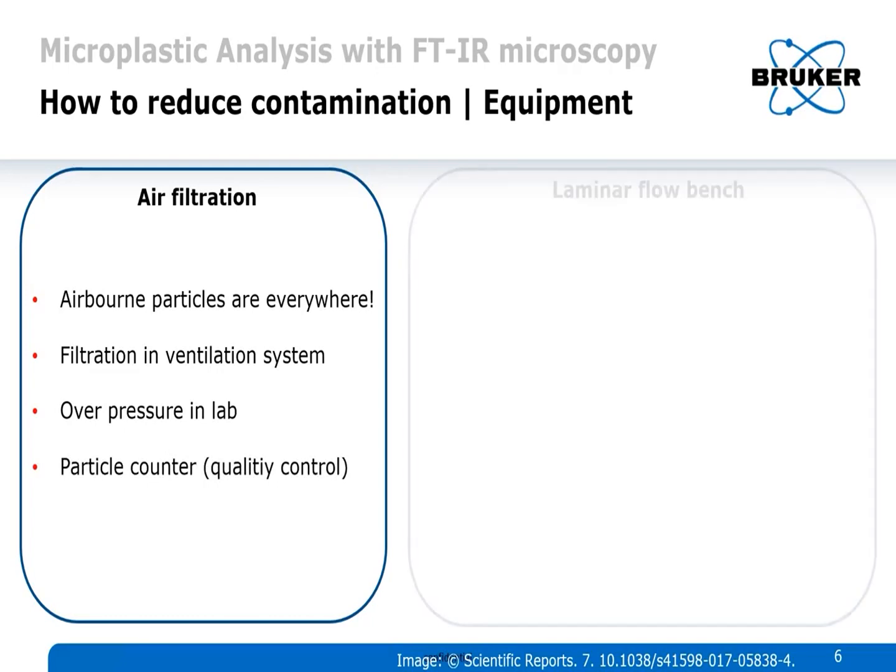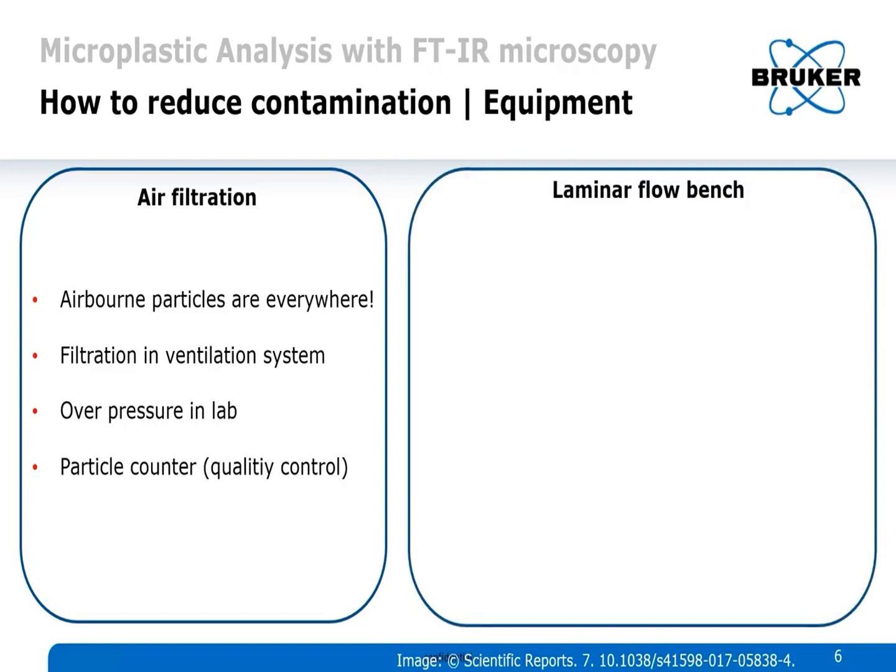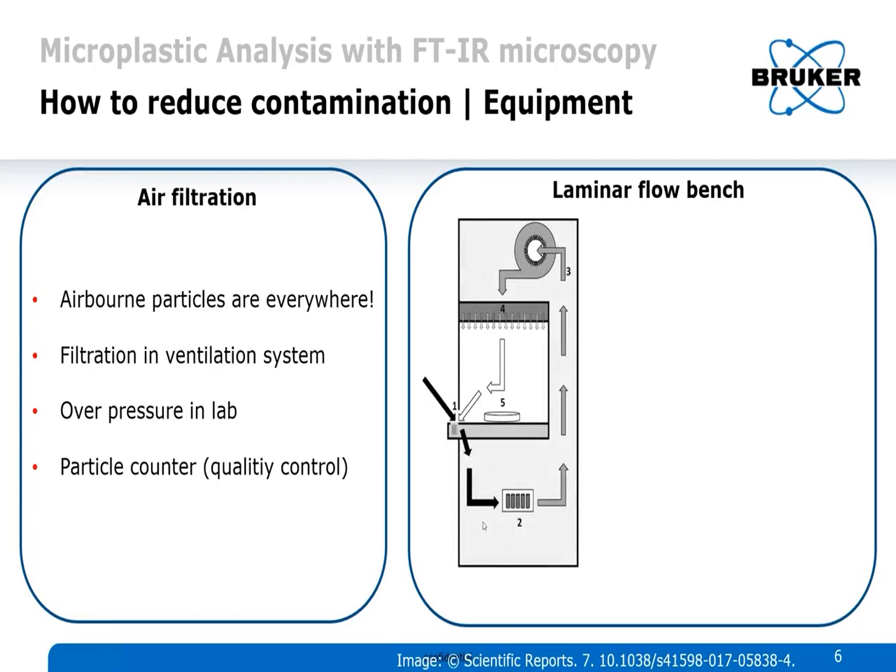But this is all quite complicated and maybe a bit too much. So there is also a laminar flow bench. This is a somewhat more simple setup where you have, with the number 1, where air comes in, it's collected at the place of entry.